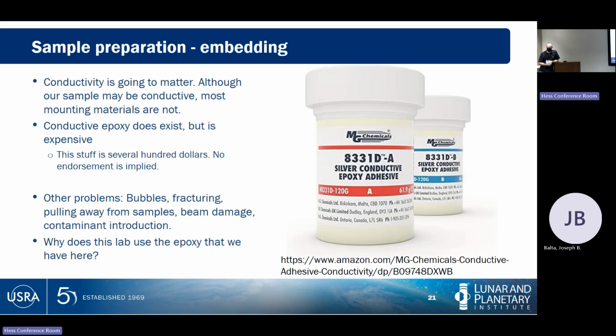There are conductive epoxies that exist. If you really care about a certain organic compound sample, like a tholin, and you need a really good image of it, and you just can't afford to coat it because the material is carbon-based, so you're going to mount it up but need it to be conductive, this could be the kind of option that you'd use here.